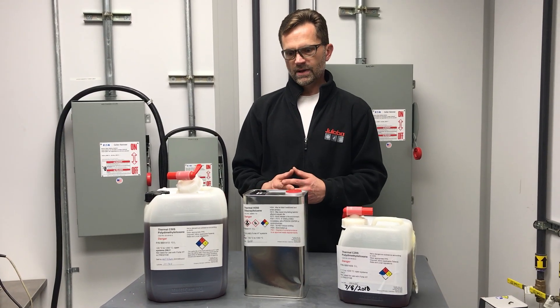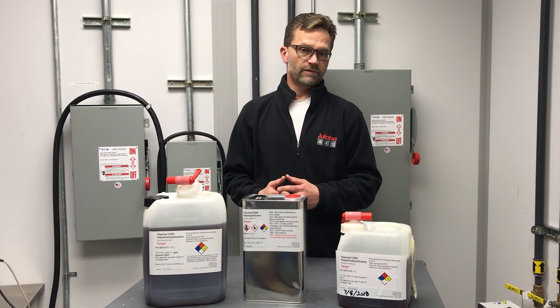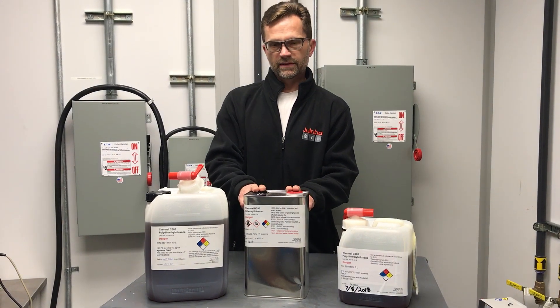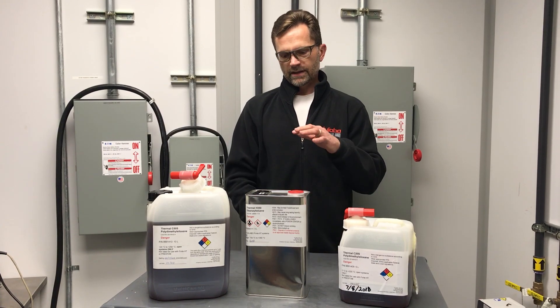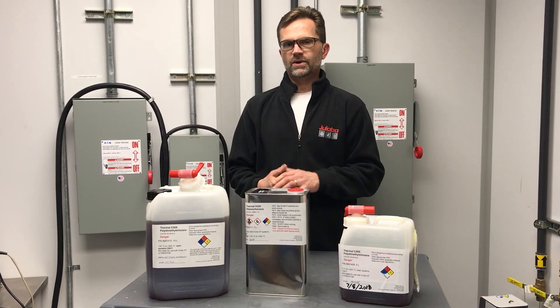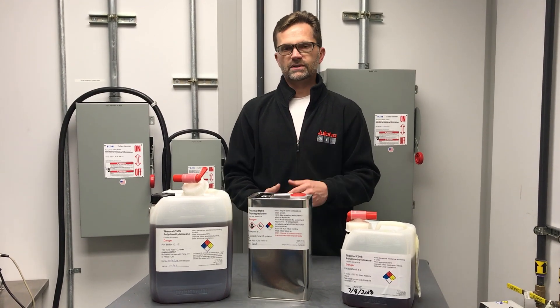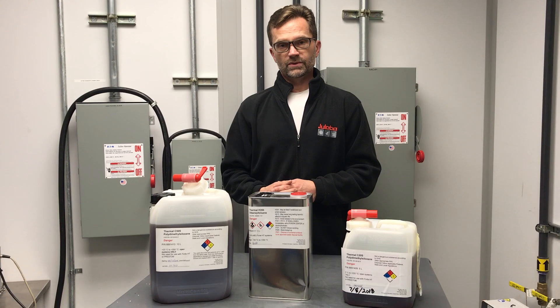To eliminate smoking in a lab at high-temperature operation, I suggest that you investigate our Forte-HT hydrodynamic heating circulators. It utilizes Thermal H350, which has an upper temperature limit of 350 degrees C. Due to the heat exchanger design, the hot fluid is not exposed to atmosphere, so you eliminate the smoking that you see in the high-temperature open bath systems. In addition, it reduces oxidation from reduced exposure to oxygen.